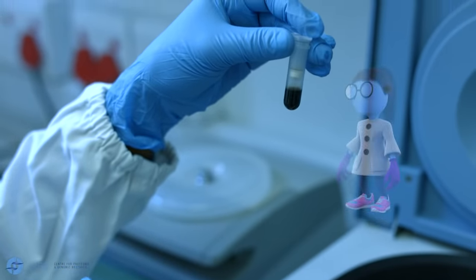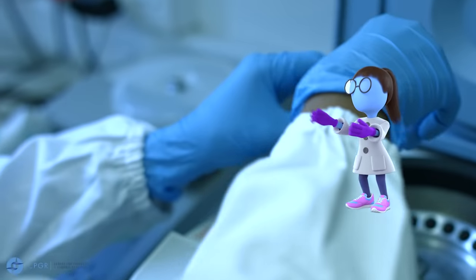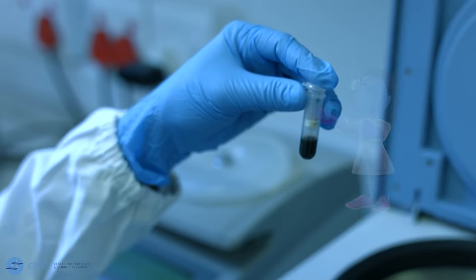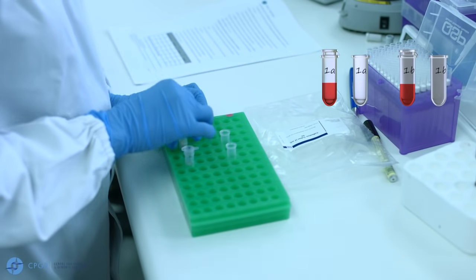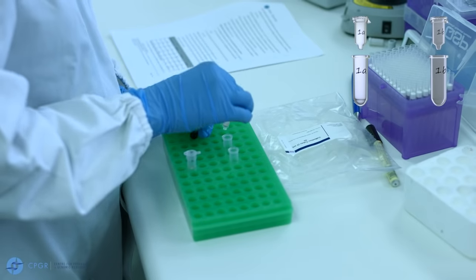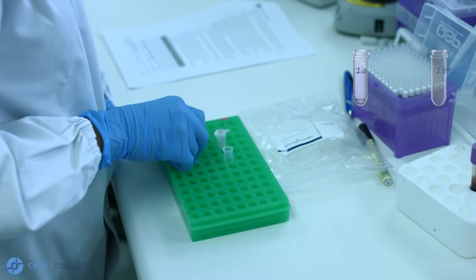At the end of the centrifugation period, all the filtrates should be in the collection tube. Transfer the spin columns, which now contain the DNA, to clean collection tubes and discard the collection tubes containing the lysate.